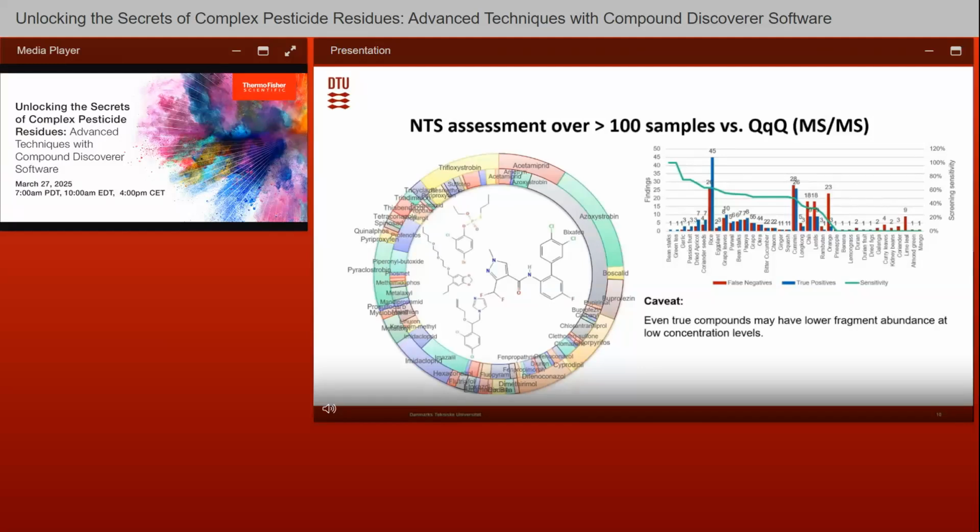False rates highly rely on the sensitivity of the fragments for the confirmation below 10 ppb, which is easily achieved by triple quad technology, here with risk of false positives and false negative results, which still must be handled with caution, especially for low concentrations that make up these complex matrix definitions.